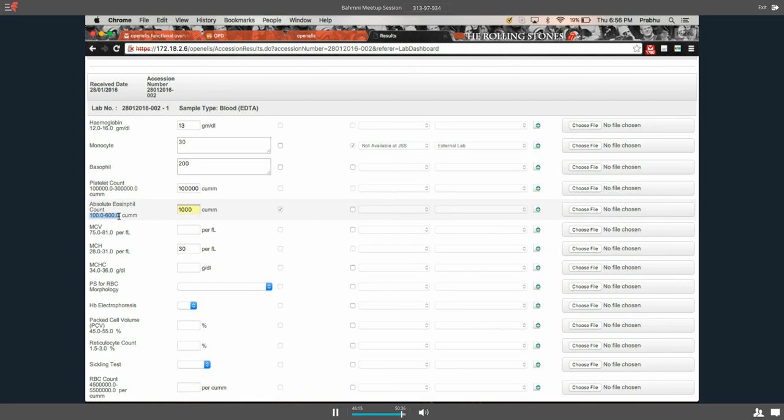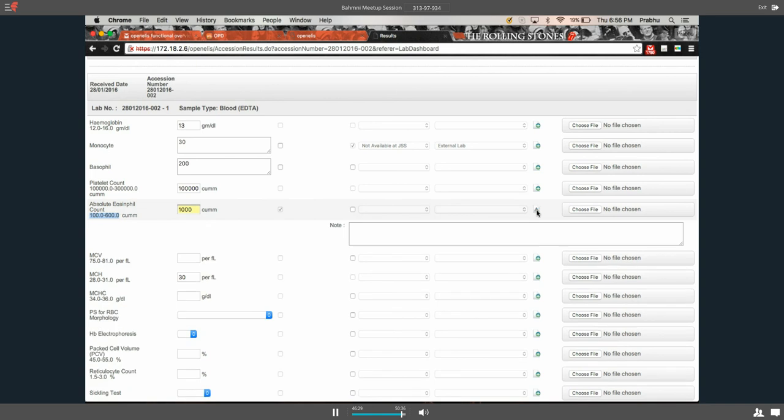Okay, that sounds good. The other thing is, I did see you could add a note. Can you add it to a specific test? You can. You have a notes section associated with each of them. Oh, right, well, that can solve the problem. To me, that is the best way of handling one of those out of range ones, because you put in the note what happened when it was numeric, that it was actually greater than this, rather than putting in the exact value. Correct. That could be one of the solutions.